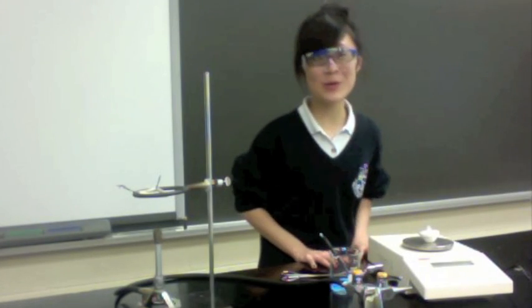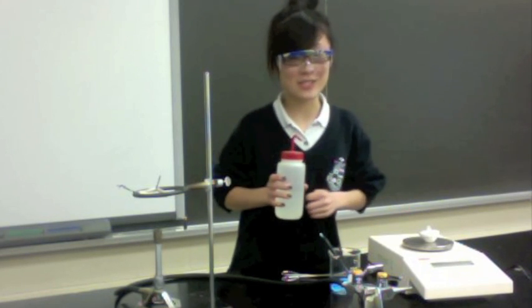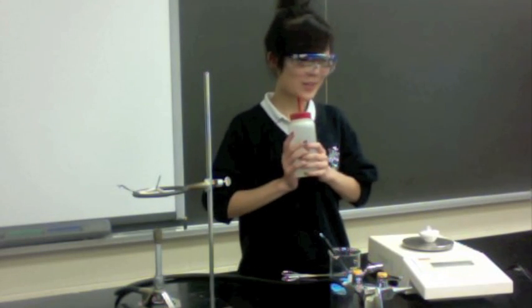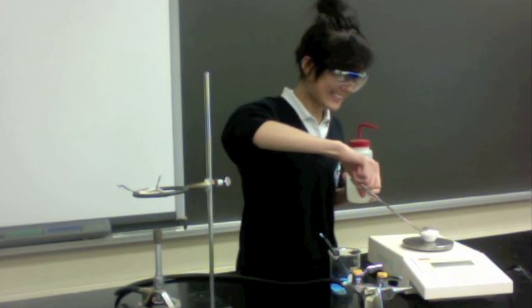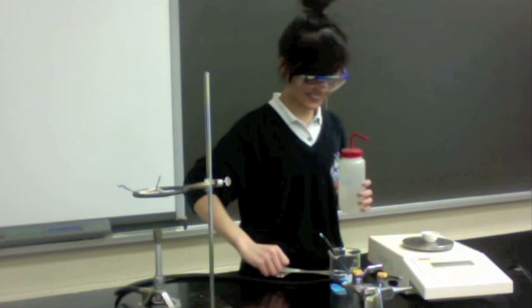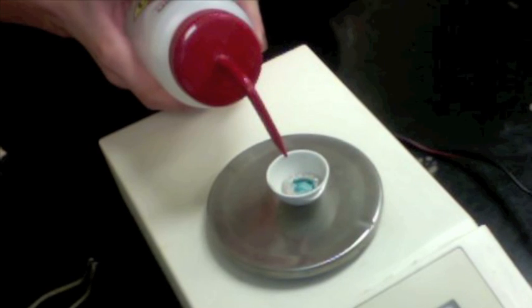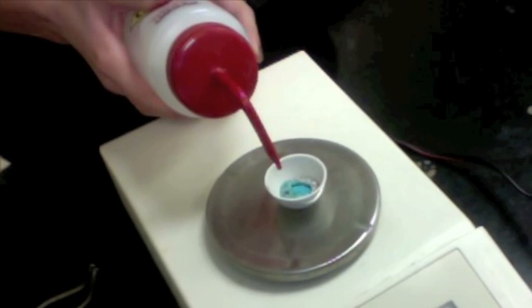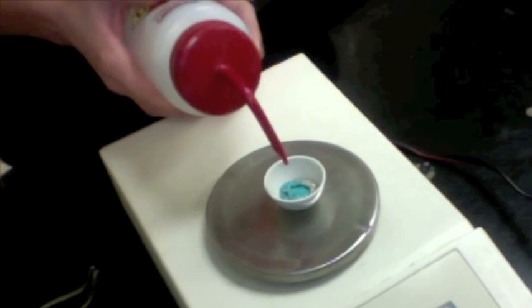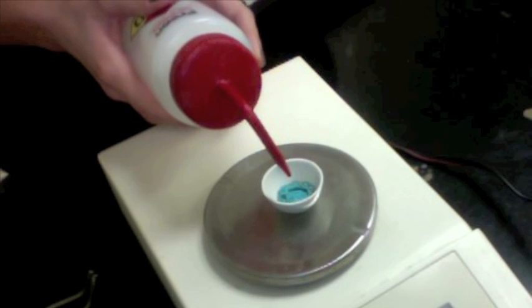Now that our crucible is cool, we're going to take a few drops of distilled water. This is because the ionic compound inside is now anhydrous — we're going to add the water to make it a hydrate again. Look at what's happening! It's turning blue! Record your observation.